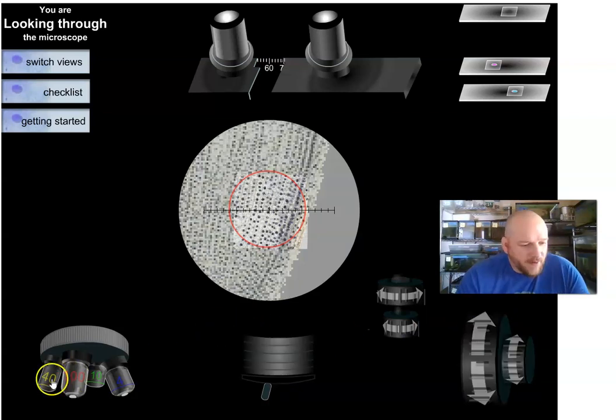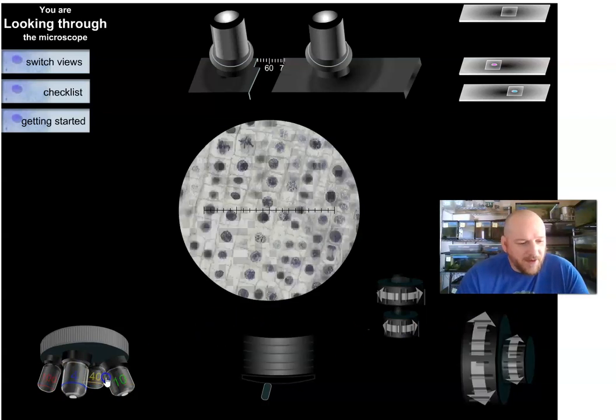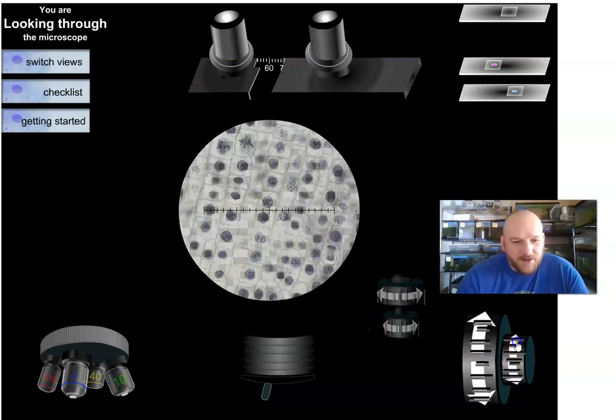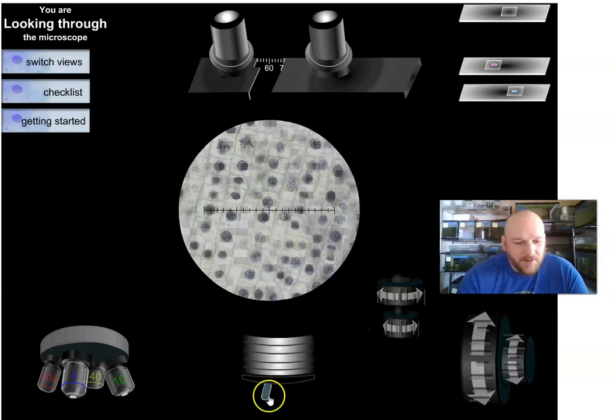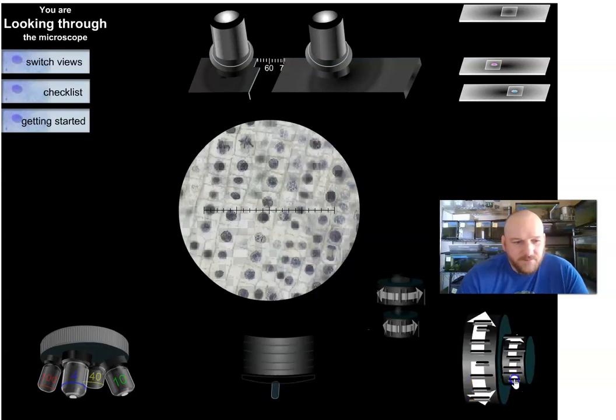Once we're here we can crank all the way up and so on but it's pretty much basic microscope use. Again we're going to go ahead and focus it a bit here so we get some good mitosis images. Maybe a little more diaphragm.